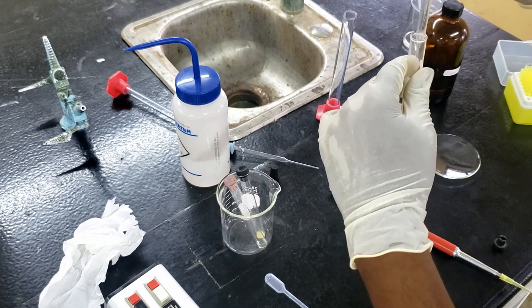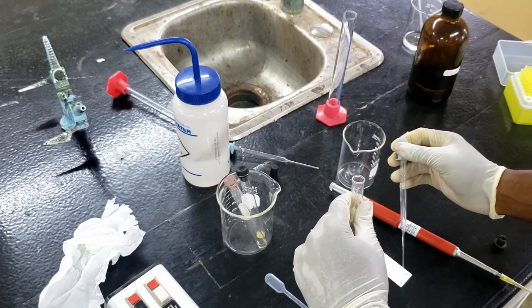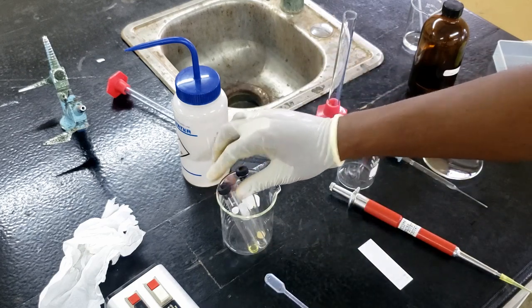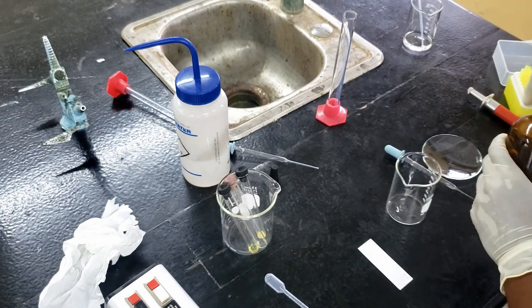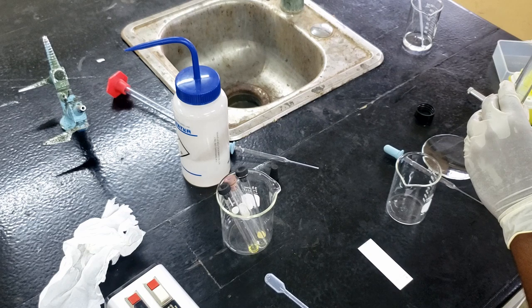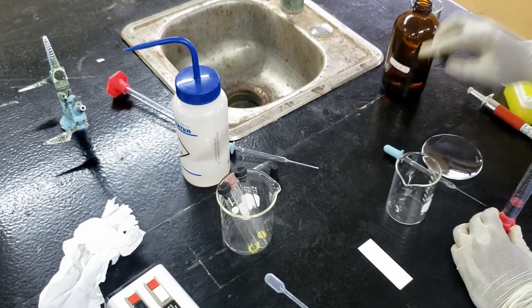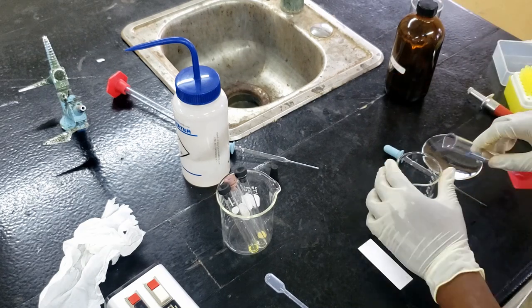And we can now take our second spotter. And we're just going to put a tiny spot for the O-bromonitrobenzene. Now that both of those are ready, we have some eluent solvent here. I want about 10 mLs of eluent. Add that to a clean beaker.